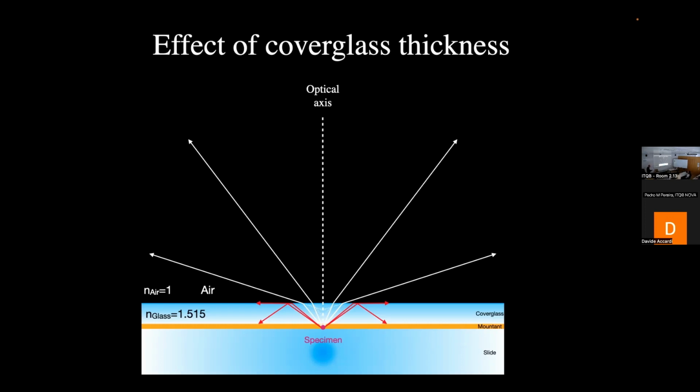Then we remove this just to have a cleaner screen there. And then if I click here, and if you have sharp enough eyes, you will see here dotted lines that actually prolong these rays of light, and this represents the apparent direction of propagation of our light. Okay, so what does it mean? That if we look through our microscope, this ray of light will appear coming from this position, and the same for this, while this ray of light will appear coming from this position, while, for example, the central ray of light will appear coming from really the specimen itself, because it will not be deviated, because it goes perpendicular. So this will actually create, as we were saying before in this example, an elongation of the structure observed in the Z optical axis. Okay, so there is a dispersion, defocusing in Z of the structure we are observing.